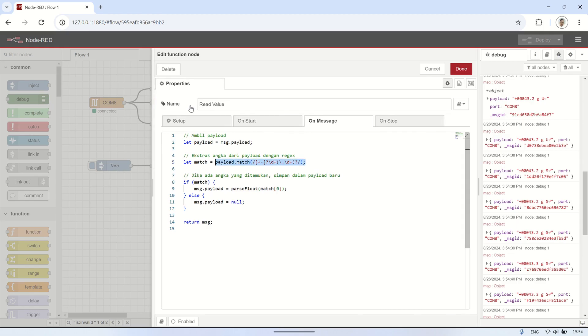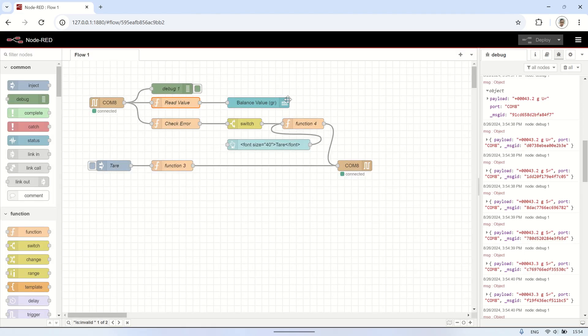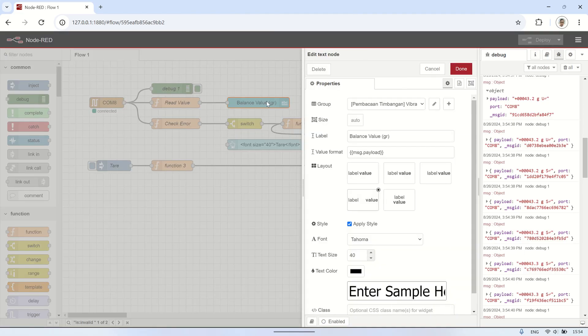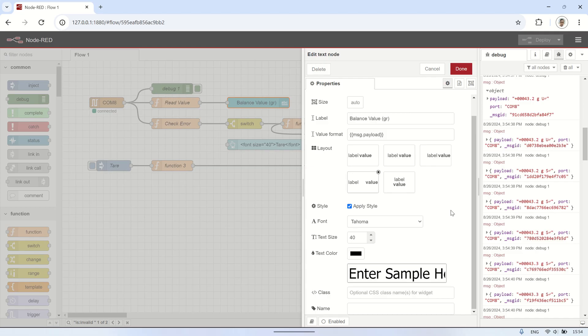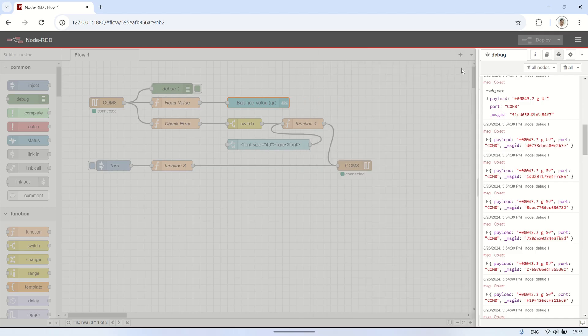To extract the reading value from the payload, I use a function node which is then connected to a text node to display the balance reading on the Node-RED dashboard. In the text node, set the apply style option to customize the font type, font size, and color so that the weight reading is displayed in a larger and more visible format.